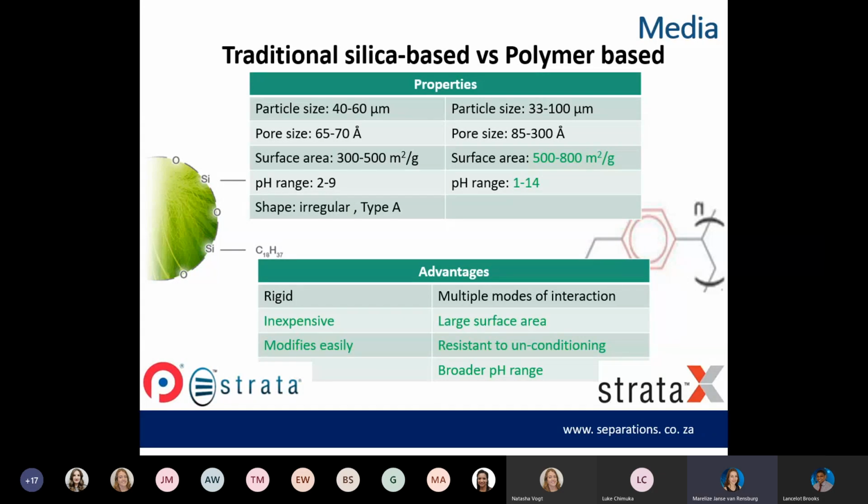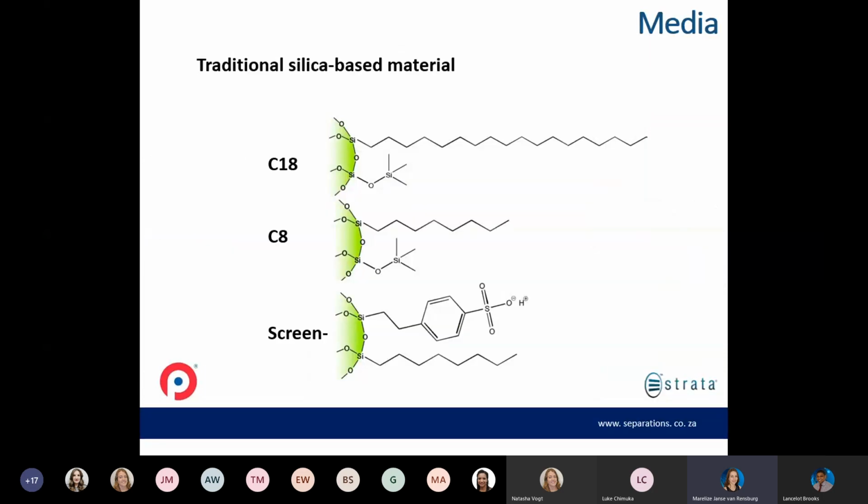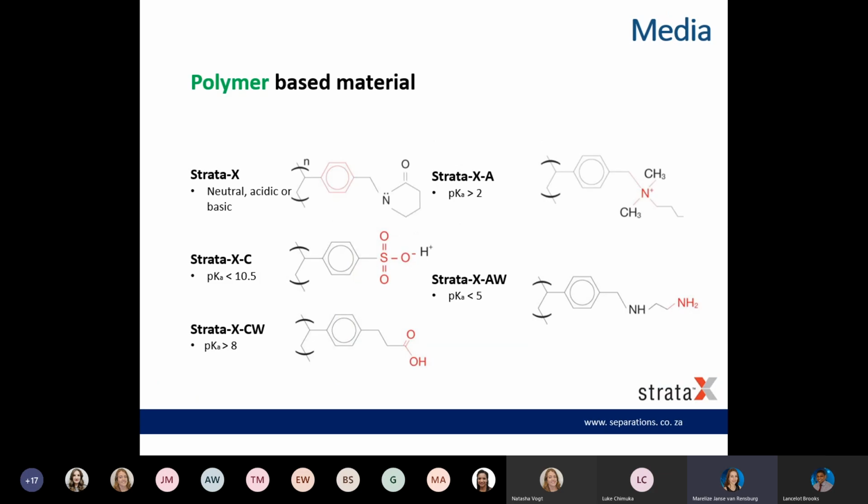So just quickly to touch on unconditioning of your SPE. Some of the selectivities that are available in silica-based material, like C18, need to be conditioned. And when the cartridges run dry, we call it unconditioning, where your phase might collapse and then you will have to recondition before you can continue. And often this can lead to some results being lost. So this is one advantage where polymer-based media might be a better idea if you are quite new to SPE, because it is resistant to unconditioning.